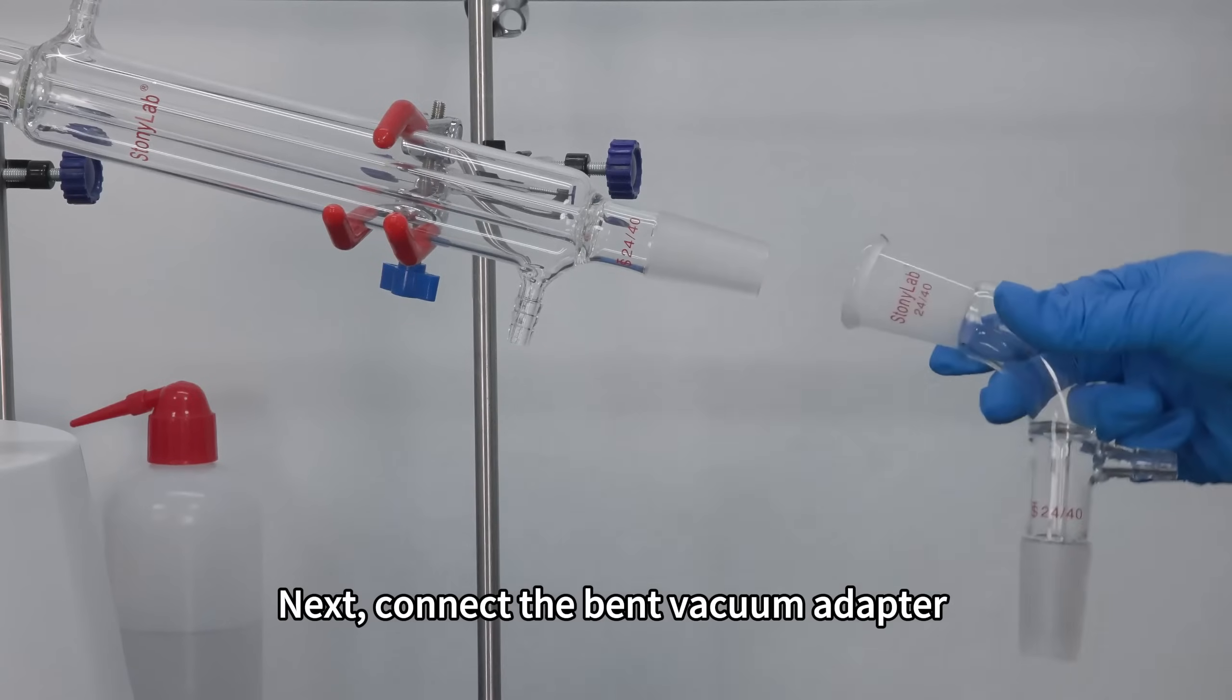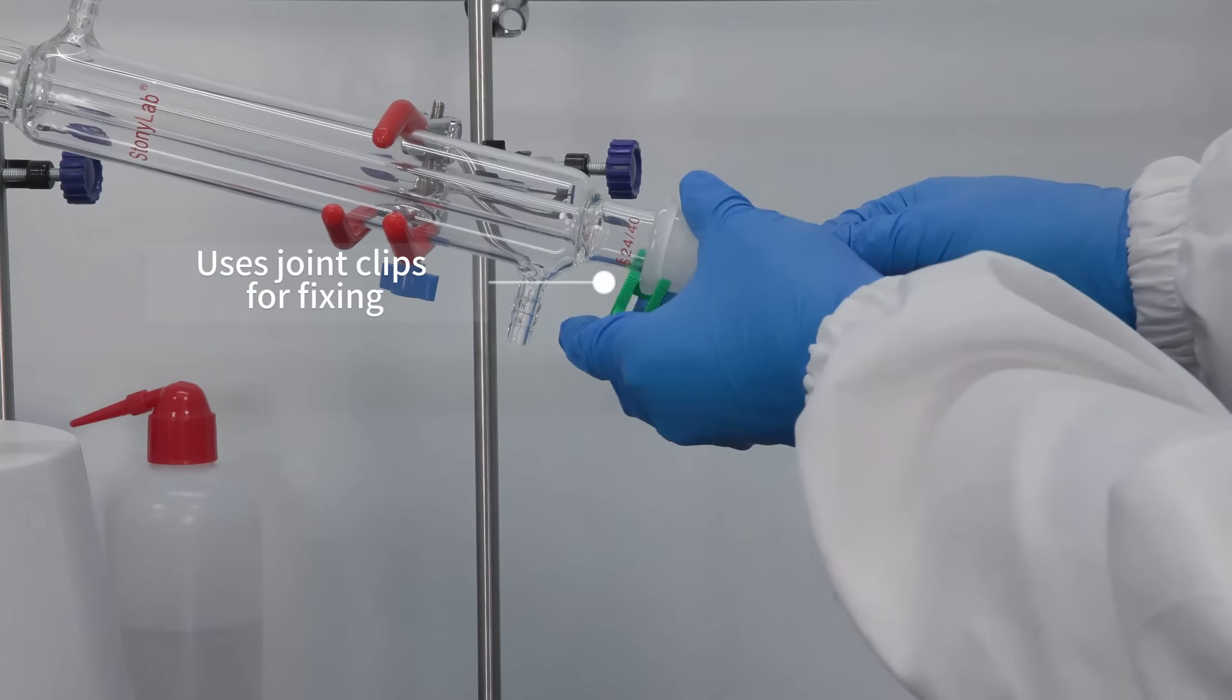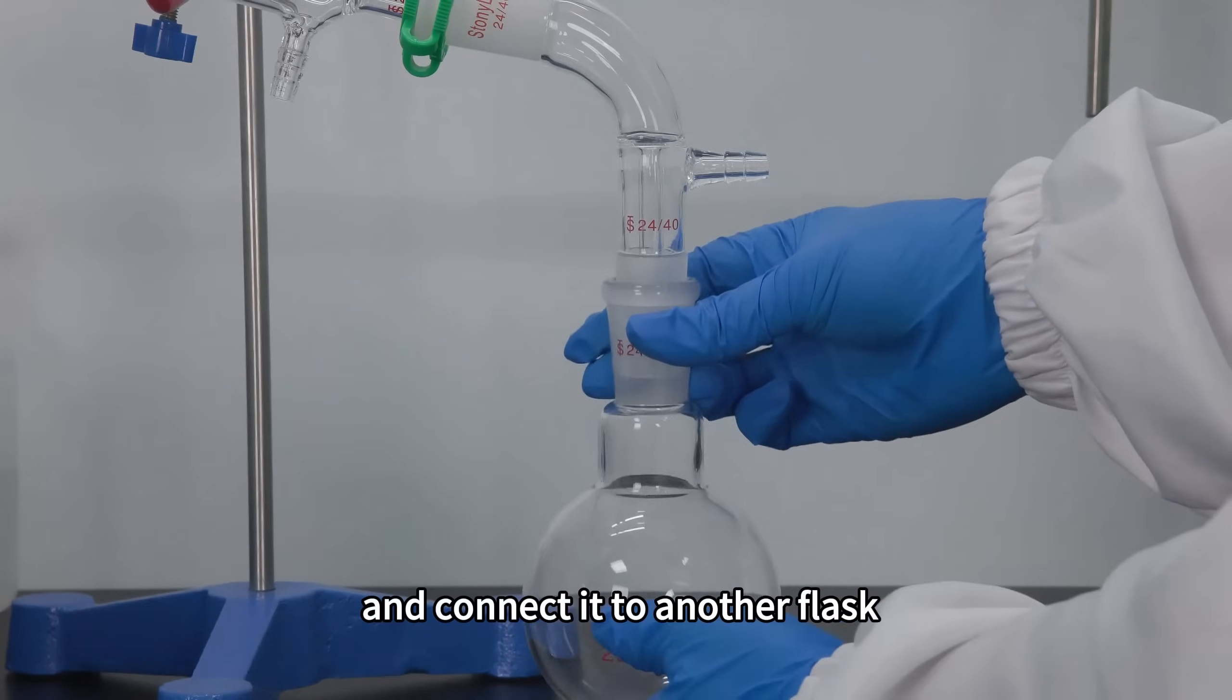Next, connect the bent vacuum adapter to the other end of the condenser and connect it to another flask.